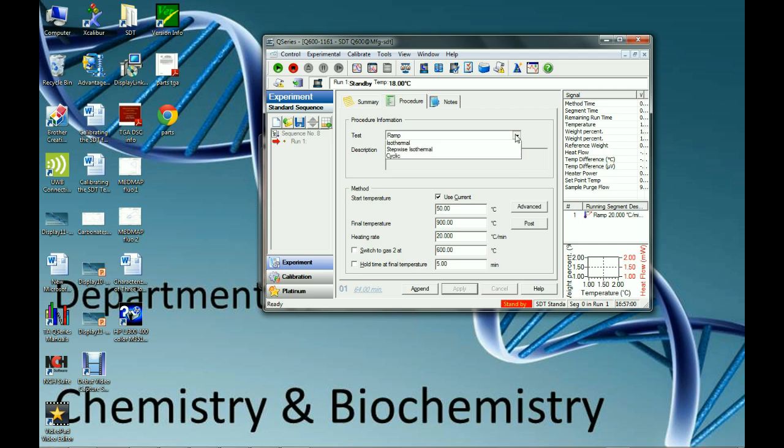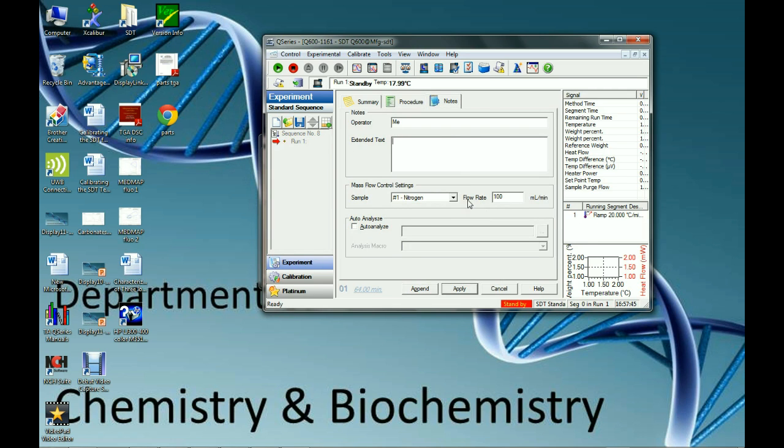So this is just a very basic method. You can customize it so much more for whatever you're wanting to do. This kind of experiment would be more of a cursory glance at our compound under heat.